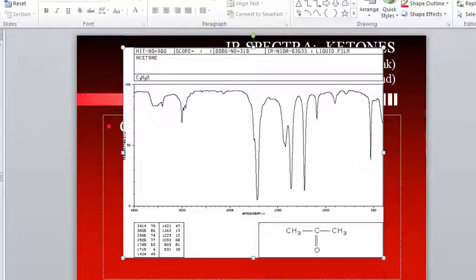The same thing happens here with acetone. There's my carbonyl. Over here to the side, there's no aldehyde. That actually is not an OH dip because it's not very strong. That's just a little bitty bump. Between 1000 to 1300, well, I actually see a peak here at 1100, and I actually see a peak here that's a little above 1200. Are both of those important? I don't know. Is just one important? I don't know. But in order for me to determine if it's a ketone or if it's an ester, I'll have to figure that out. So I write down both. Ester slash ketone, one or the other, who knows?